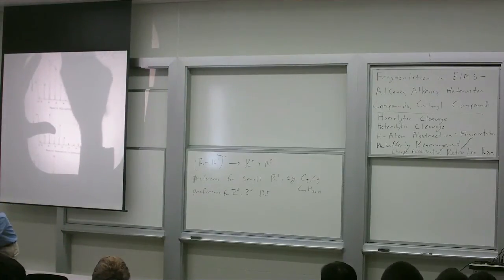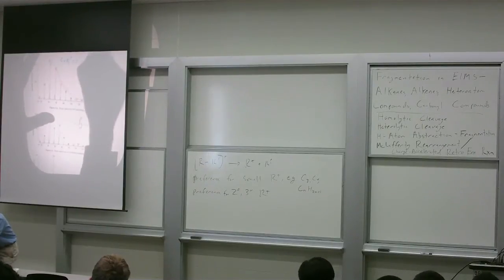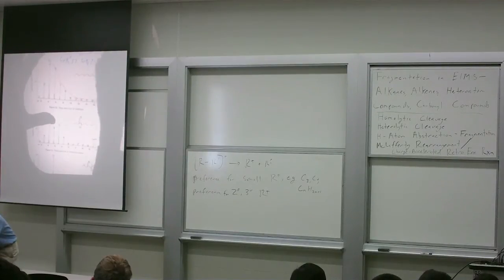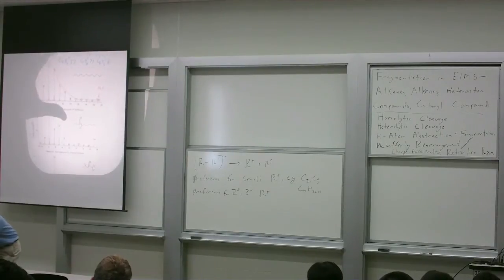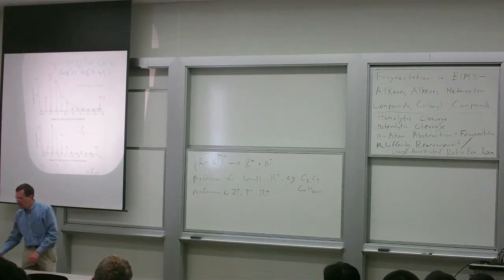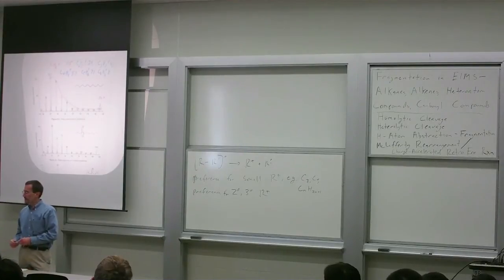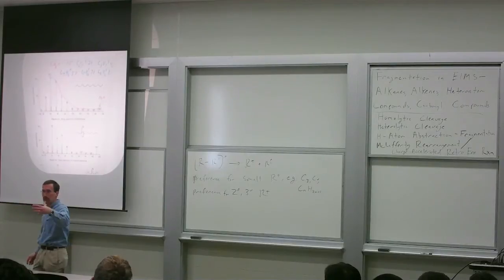Anyway, so moving up, these numbers are sort of worth recognizing. C4H9, and of course we see them all right over here, is 57. C5H11 is 71. C6H13 is 85, and so forth. Then, of course, these are basically spelled out for us in this archetype of the carbocation. As I said, you do get subsequent fragmentation, which is one of the reasons why we're not, say, just getting a hexyl peak as the biggest peak. Basically, you will keep splitting and spitting out energy.